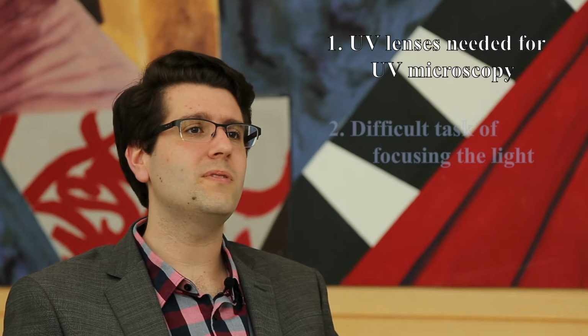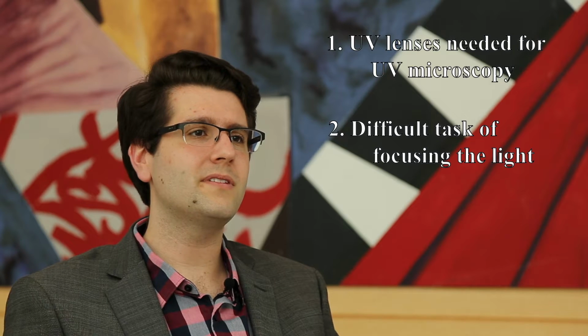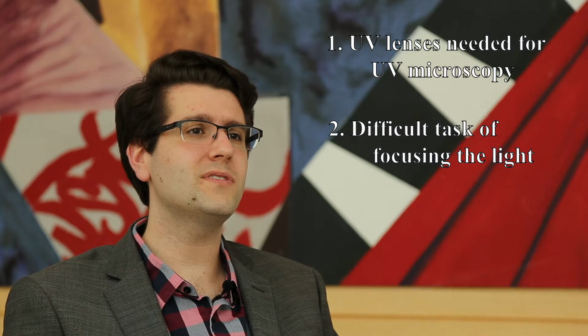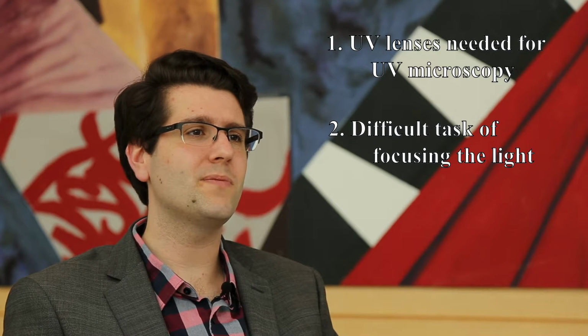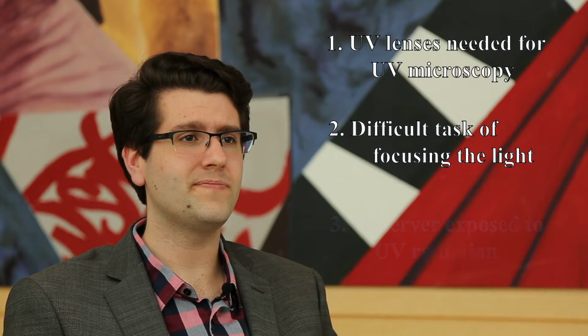Next, UV light was used to illuminate the object, resulting in the difficult task of focusing the light using visible light to form the final image from UV illumination, often producing out-of-focus images.